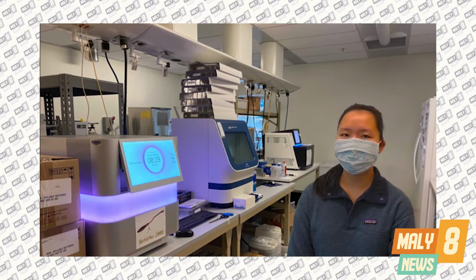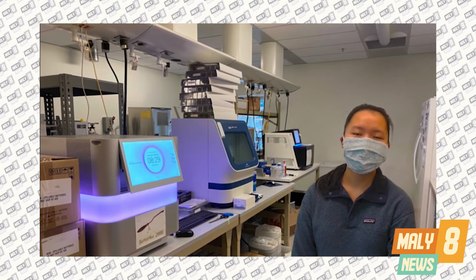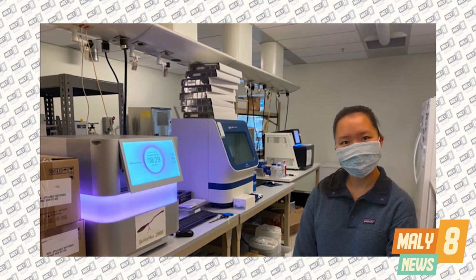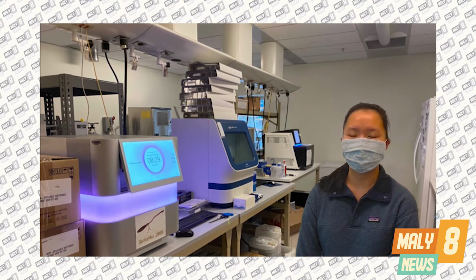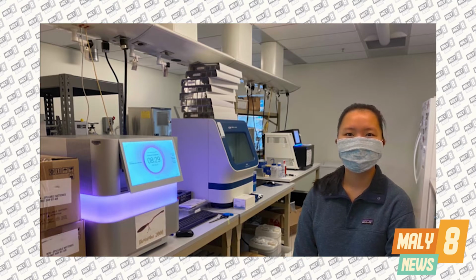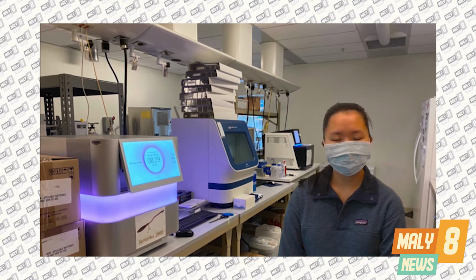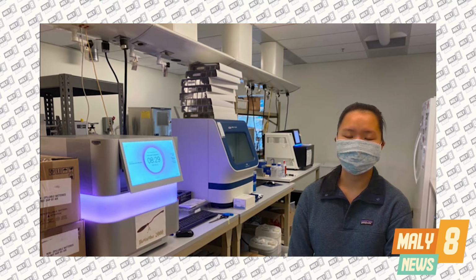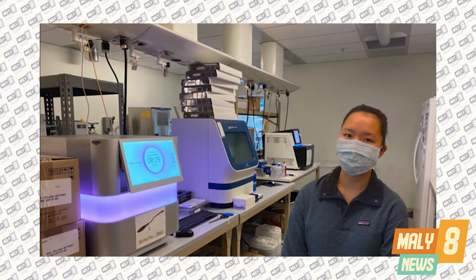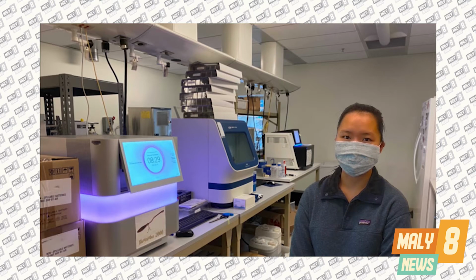So I'm looking at how CRISPR-Cas9 edits at on and off target sites within a cell. And to do that we use DNA sequencing, specifically Illumina next generation sequencing, to read out our experiments. Very cool. What other exciting projects are you working on? Yeah, so I'm working on several different protein engineering projects where we're making some off switches for our chemically inducible Cas9, and also some base editors and prime editors in a chemically inducible version of those.